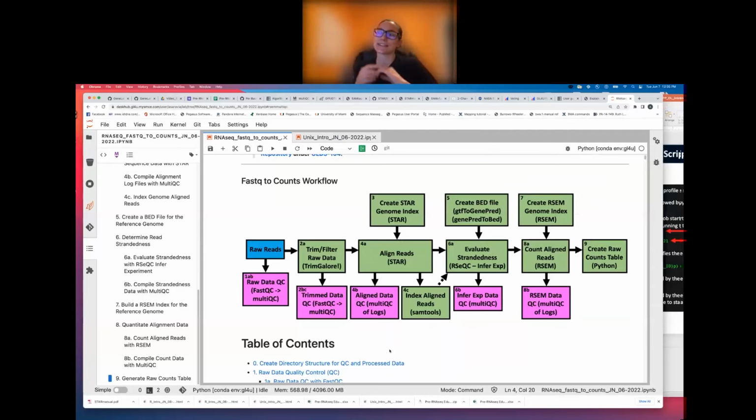Of course, this is already a lot of information, so I didn't want to overwhelm all of you by adding in all these additional QCs that we do internally at GeneLab to make sure that we're confident in the data that we're providing to our users, especially those from the samples that we sequence in-house. But I also did mention some of the RNA-seq QC analyses that we do that I didn't go over in detail here, again, just to make sure that we're seeing consistencies and things that we expect in our data. So yeah, that's a very good point.